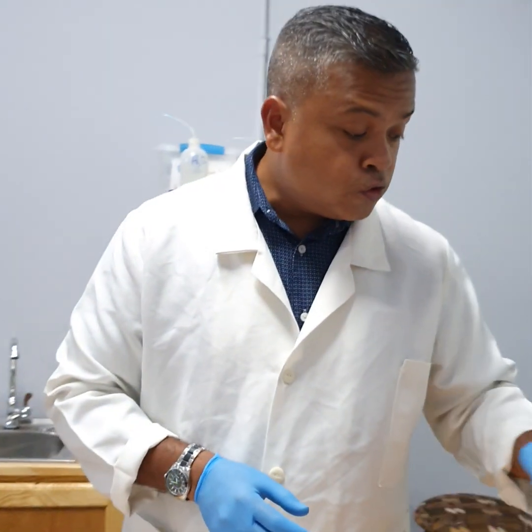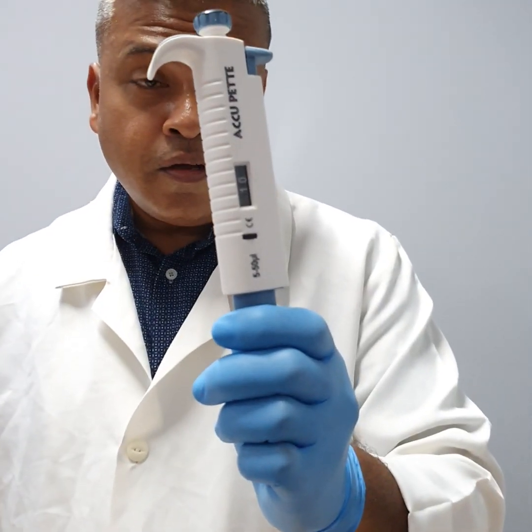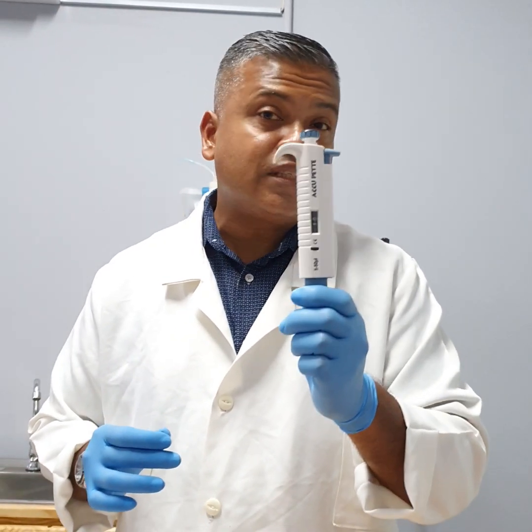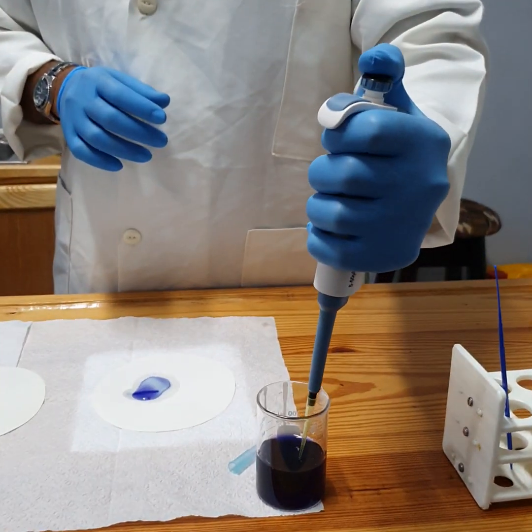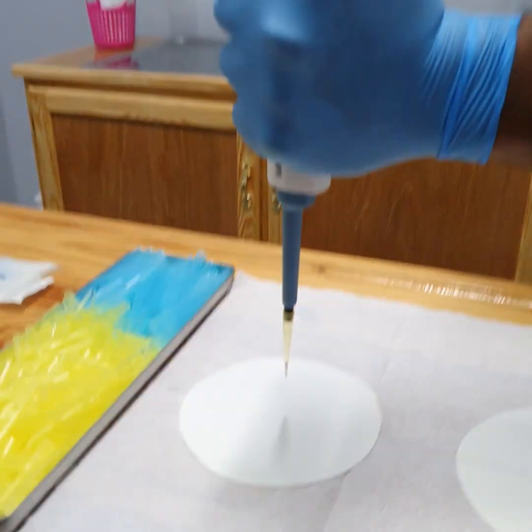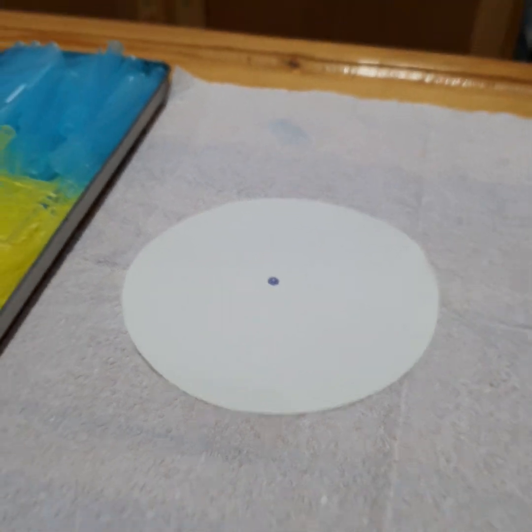Now I'm going to show you further what 10 microliter looks like, and this is another analytical pipette designed to exactly or precisely pick up or aspirate desired volumes. This is what 10 microliter looks like, and I'm going to put it here so that you can appreciate that. That is what 10 microliter looks like.